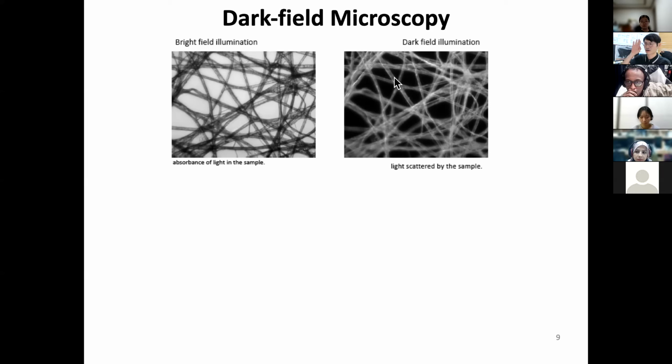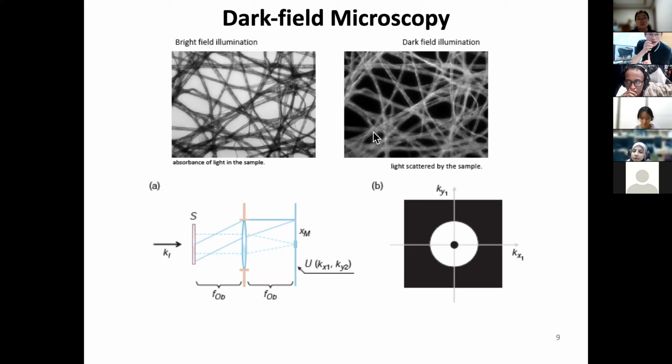So, light scattered by the sample. Now this is going to be important and not easy to understand at times. This process is, in fact, when you have a microscope and you're shining the light through the sample, and you move your objective aside so that the direct illumination doesn't get into the objective, then you actually sometimes see this dark field illumination. By mistake, I mean. But this principle can be understood by this. I'll repeat, but let me say there's a sample here. There's the objective lens.